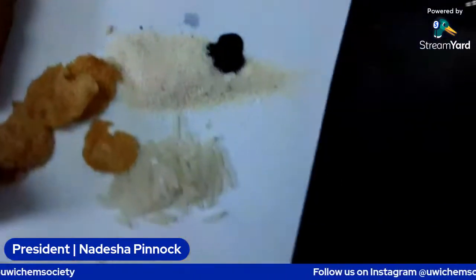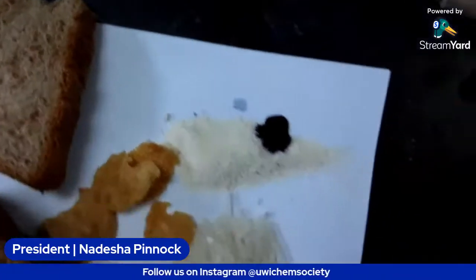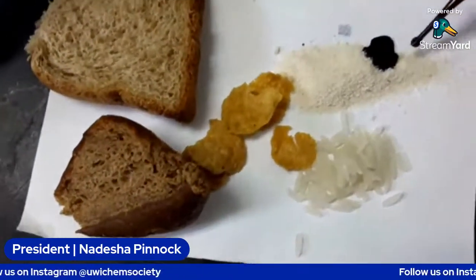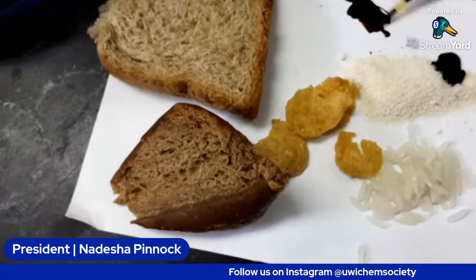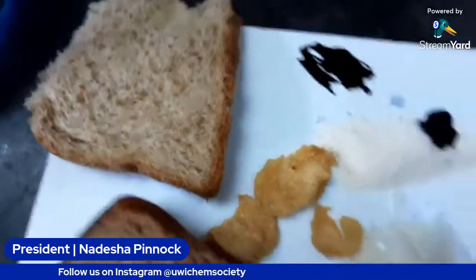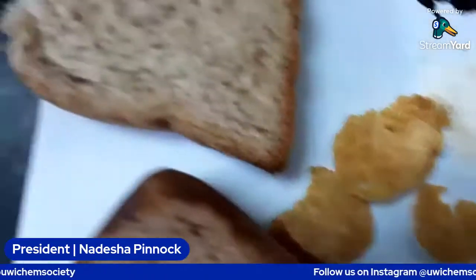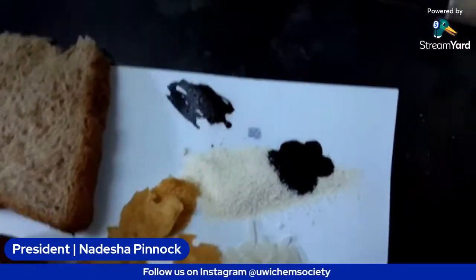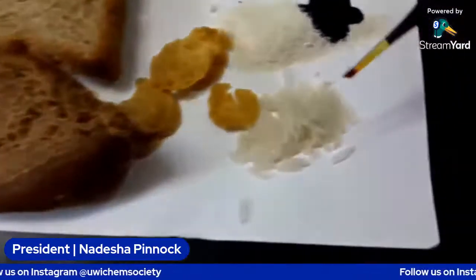If you can see, it's really dark in color. It's a blue-black color, but it's very hard to see the blue part of it. So when you add iodine to the cereal, that's why it looks blue-black. Almost black, to be honest. And we're going to add it to the rice.